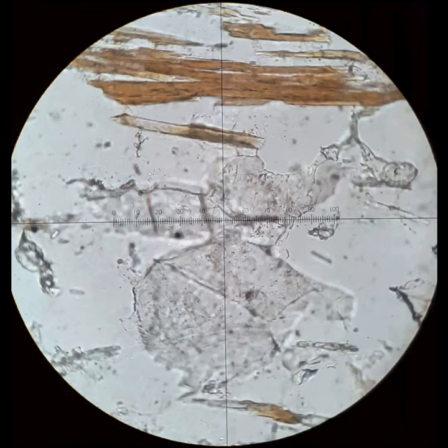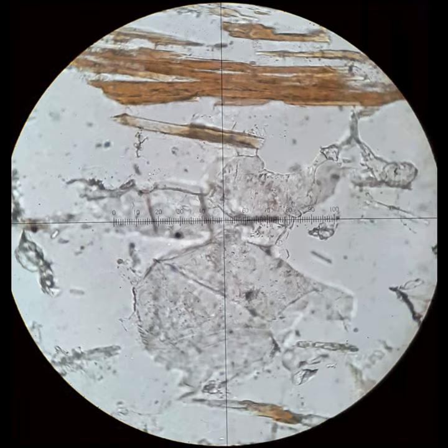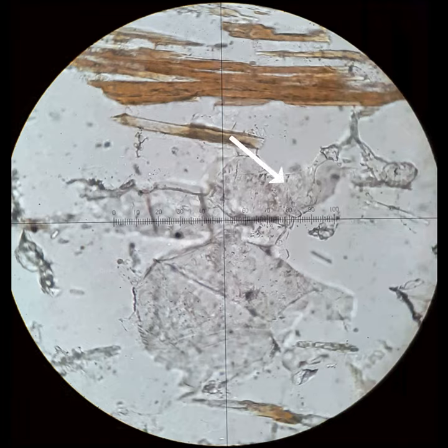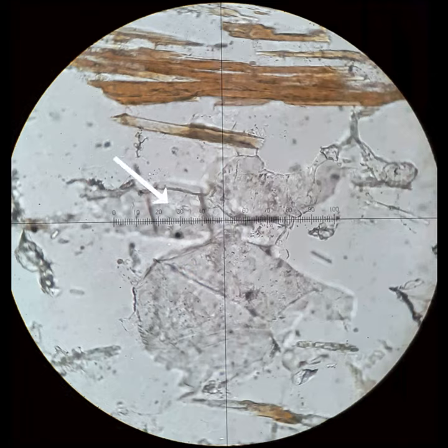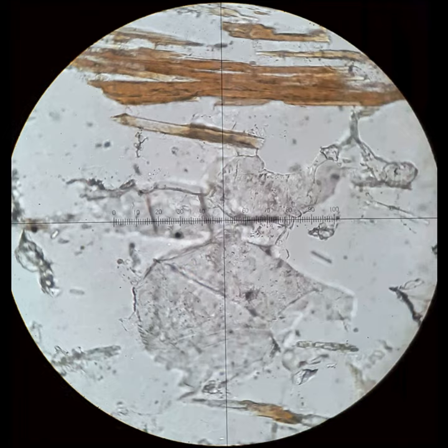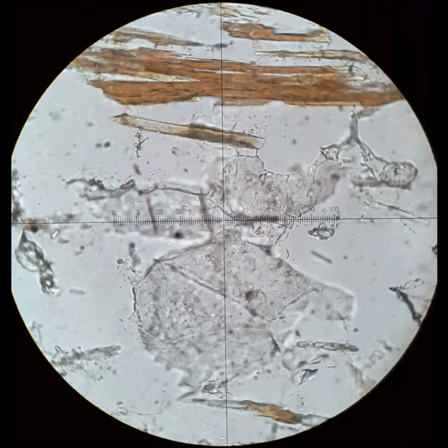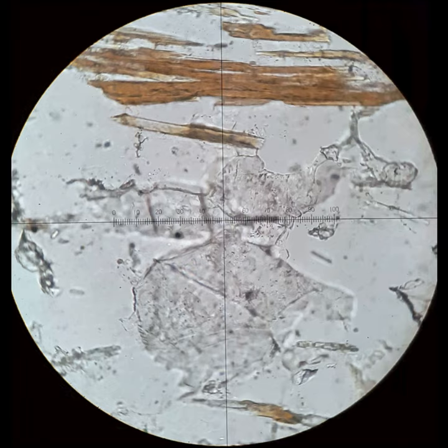So now I want to show you variable relief with two different grains. There's a grain on the right which will have different relief than the grain on the left. Just follow those two grains as I rotate the stage. You'll see that the grain boundary on one grain will be dark when the other one is light, and after I rotate the stage 90 degrees, they'll switch — the first one will be light and the second one will be dark.